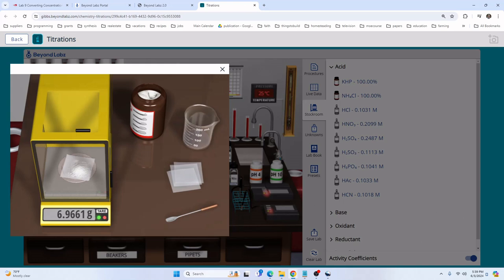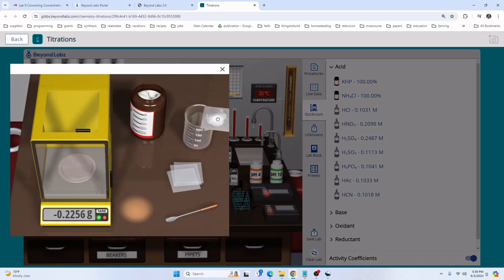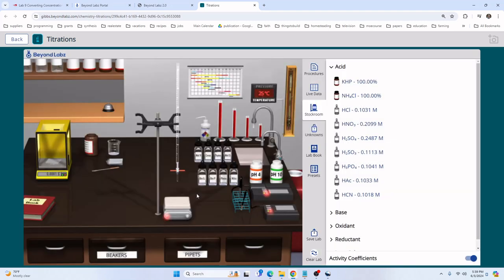I'll record that before I zoom out. I'm going to put it into my notepad: 6.9661 grams. Let's go ahead and put that in the beaker before we zoom out. If you were in the real lab, you'd want to close your sodium bicarbonate lid quickly to keep everything dry and clean, and you'd make sure to keep your balance clean as well.